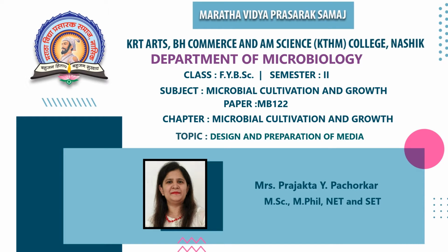Today we are going to discuss the design and preparation of microbiology media from the unit Microbial Cultivation and Growth of the F.Y.B.Sc course MB122, Microbial Cultivation and Growth.